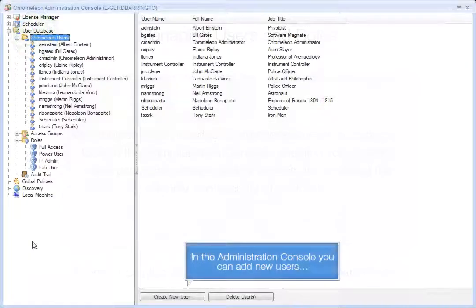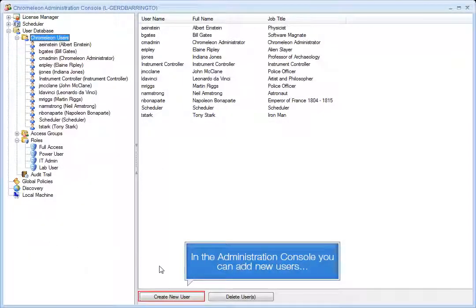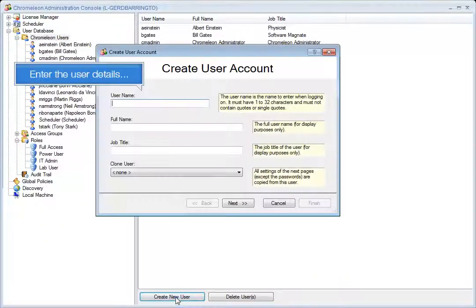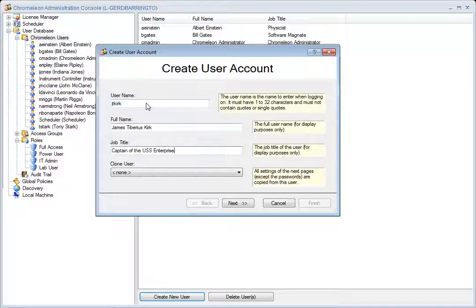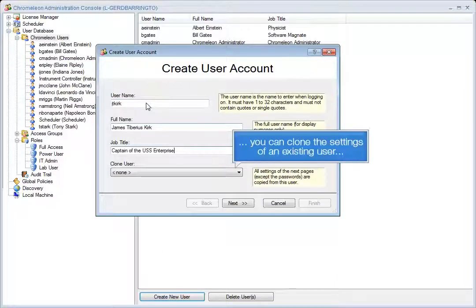In the Administration Console you can add new users. Enter the user details. You can clone the settings of an existing user.